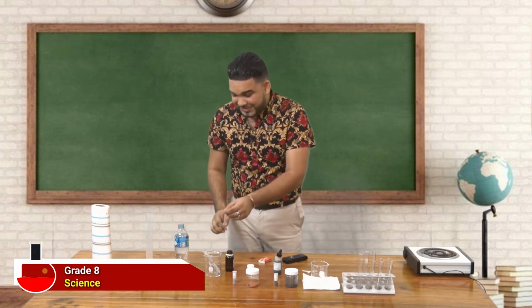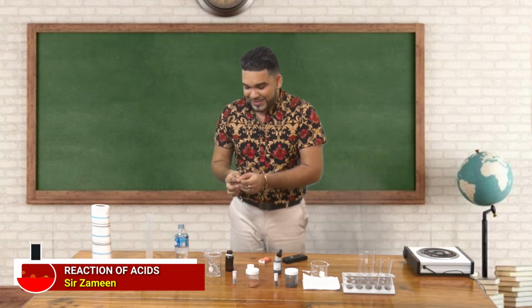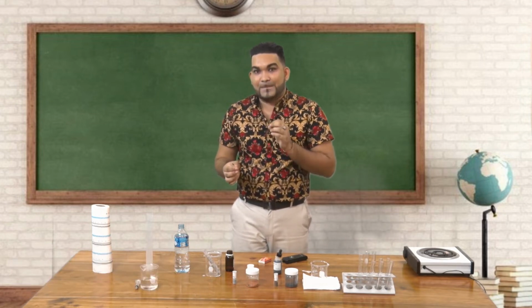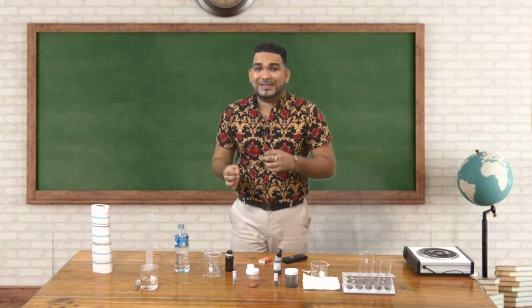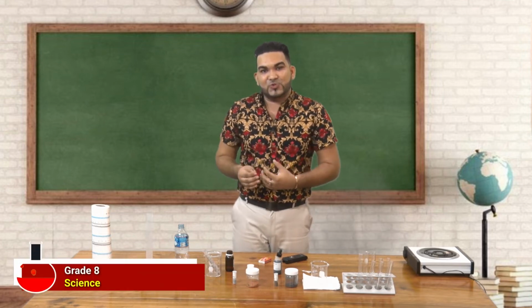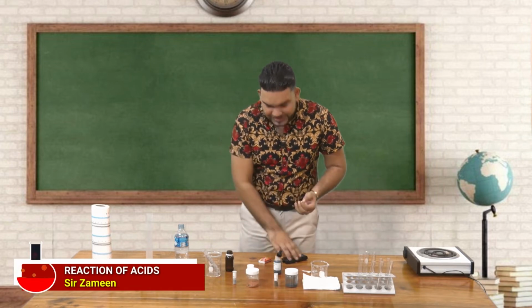Ooh, you see that reaction happen very vigorously there, isn't that so? And if you had listened a little bit closely, you would have heard a pop sound. That pop sound indicates something was being released after the reaction occurred. Alright, so let us move on.